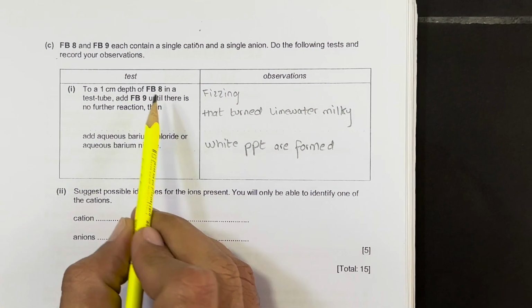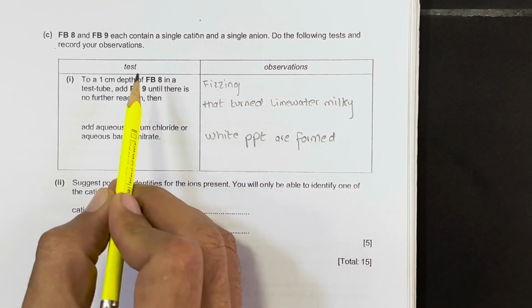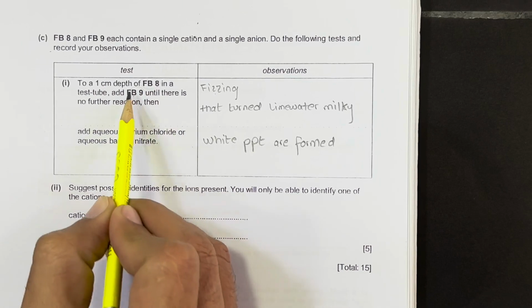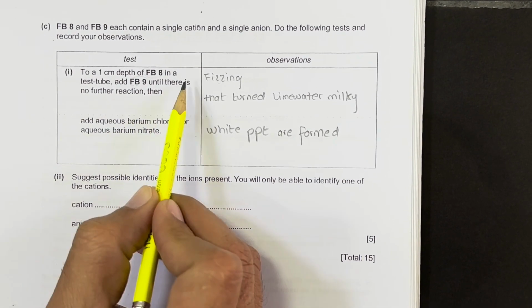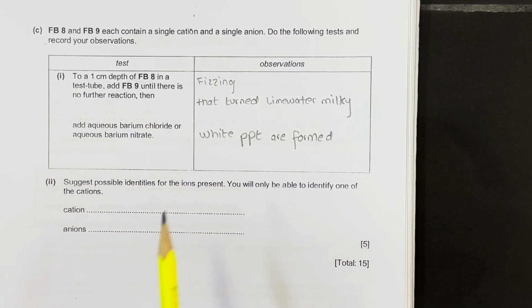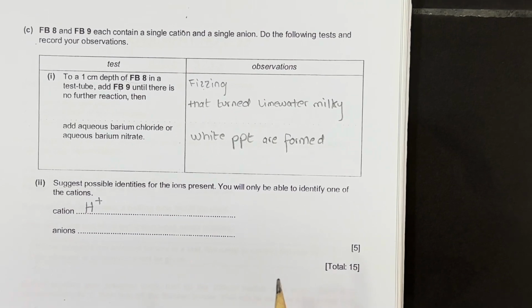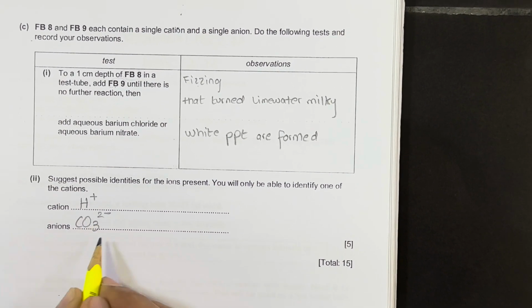Now, once we added FB8 to FB9, we got fizzing. It means one of them, FB8 or FB9, must contain an acid and the other one must contain a carbonate salt. Therefore, when carbonate reacts with acid, it gives off carbon dioxide and water. So the cation detected must be from an acid, that is H+, and the carbonate from a salt, meaning CO3 2-.